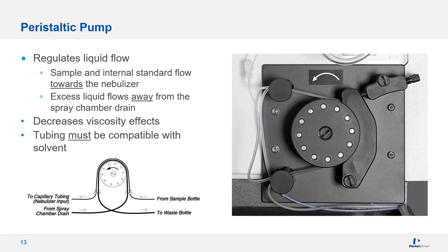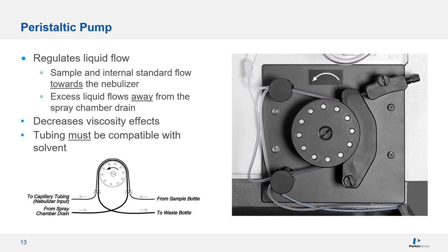Once your tubing is hooked up correctly, you need to adjust the tension on it until you see a steady flow. You should do this with the nebulizer gas turned off, so the flow of that gas doesn't pull the sample through the flow path. For this step, we only want to look at what the pump itself is doing. I recommend introducing air bubbles into the flow path by pulling the autosampler probe in and out of a liquid several times.